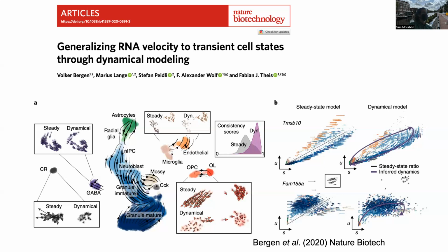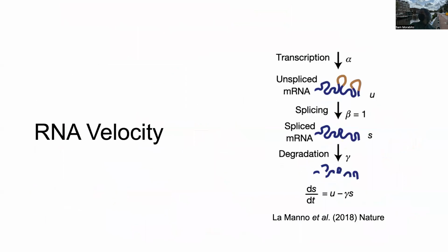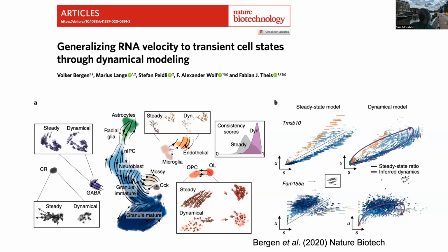So it's essentially unusable. It ultimately relies on these spliced and unspliced quantities, which can vary a lot depending on the sequencing batch. And there's not any way to batch correct for RNA velocity. So pretty much all these RNA velocity methods show you an n equals 1 single cell sample. You can run them mixed, but I've not really seen that shown in the papers. Other people using them will do that, but then the results can get messy.